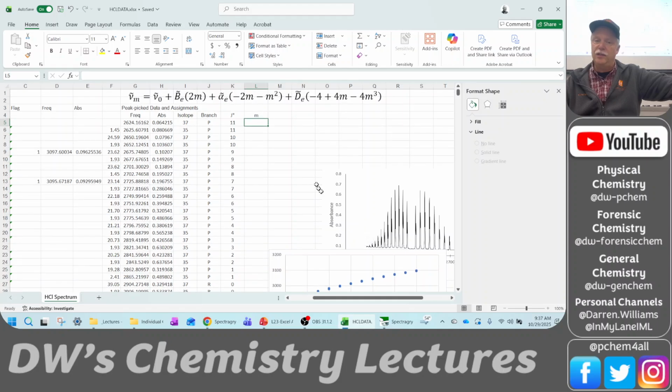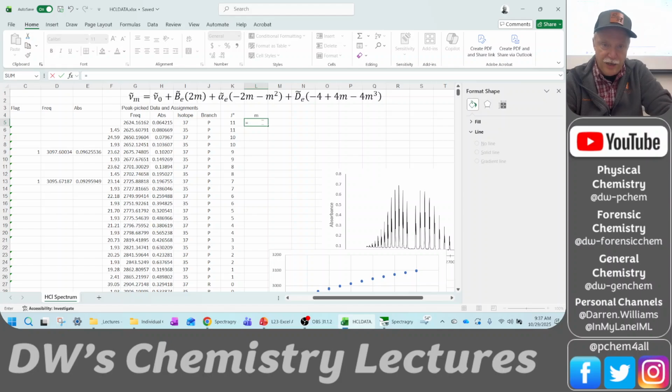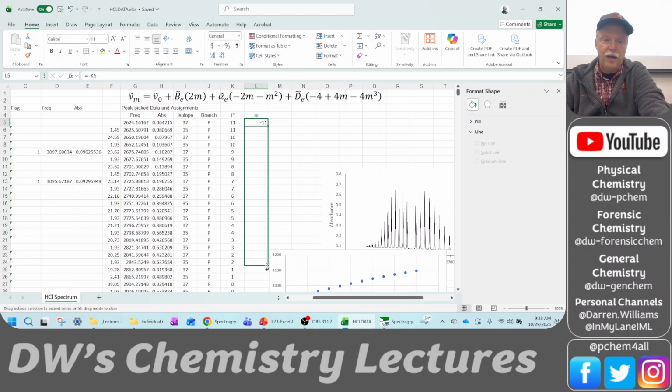Well, that makes sense, right? So M should be minus J. So for the P branch only, M is equal to minus J. So that's minus 11 for the P11 line. And I'm going to go down, but I'm going to stop at P1. So there's my M values for the P branch.